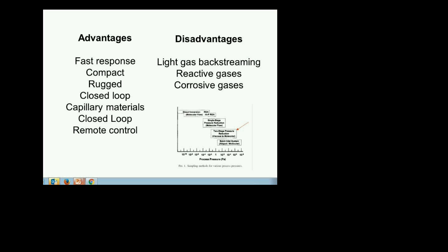Right. You will introduce the hydrocarbons, and I guarantee you that after a while you're going to start seeing degradation. There's no choice there. But here's the deal. If you keep your pressures low, in the 10 to the minus 6 and under, and you use the RGA to sample, you will get a spectrum. You just need to collect the spectrum and move on. And by the way, every single time you want to know what your background is so you can subtract it. And then what I would do is, it's inevitable. Eventually you will start degrading.